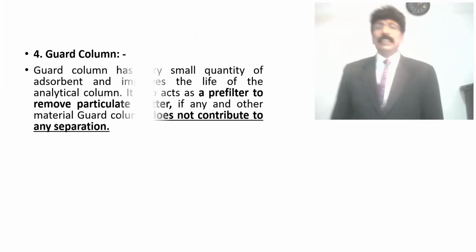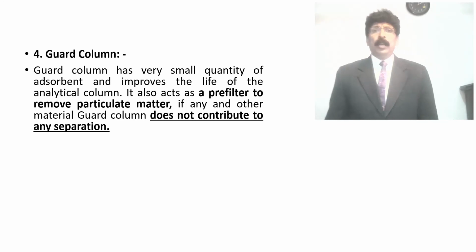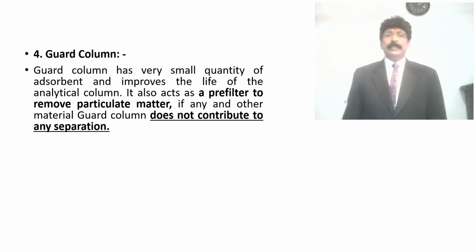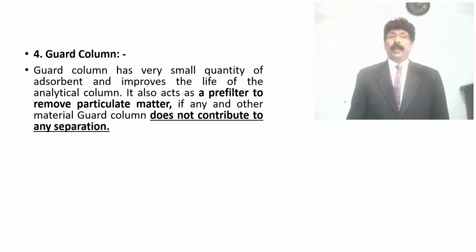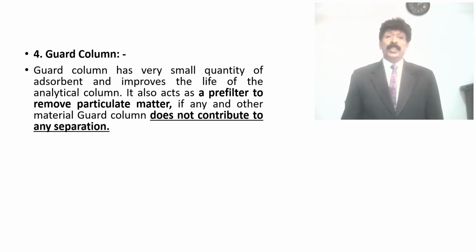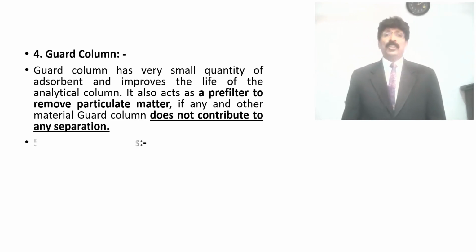Guard column, as I told you, acts as a filter. There is no separation. The guard column has a very small quantity of adsorbent, and improves the life of the analytical column. It also acts as a pre-filter to remove particulate matter or debris, unwanted matters, impurities. The guard column does not contribute any separation in your experiment. So nowadays they are even using many filters in between.